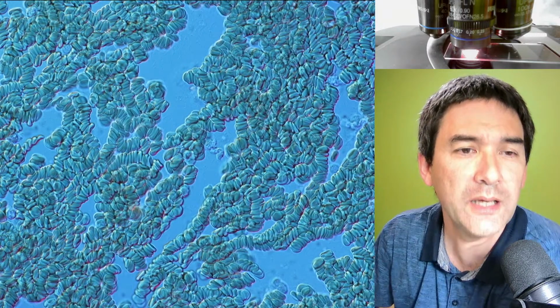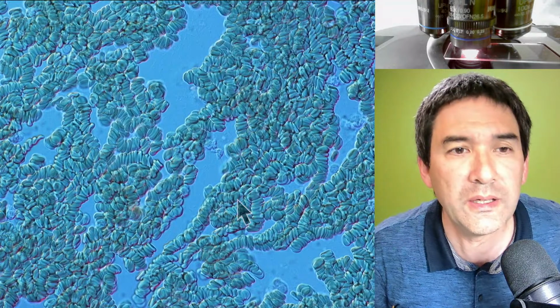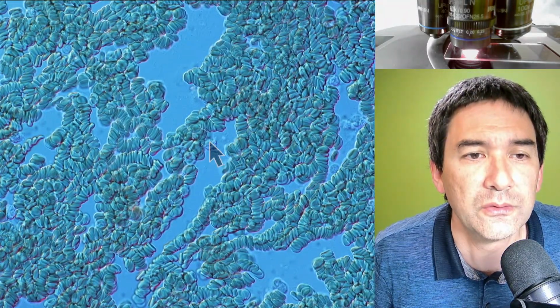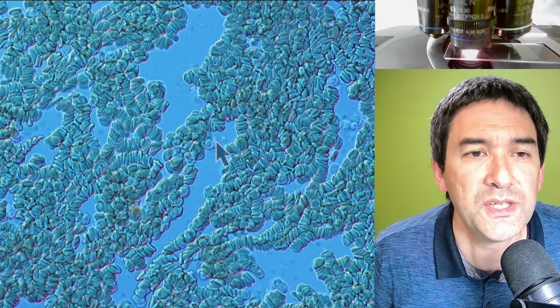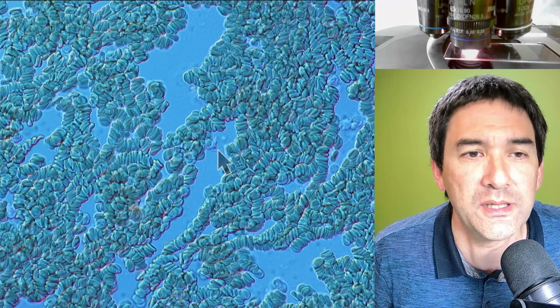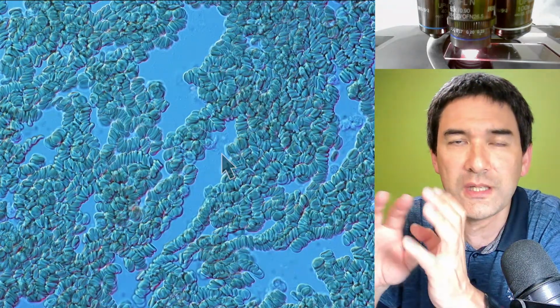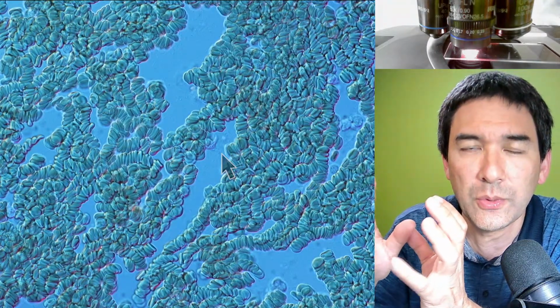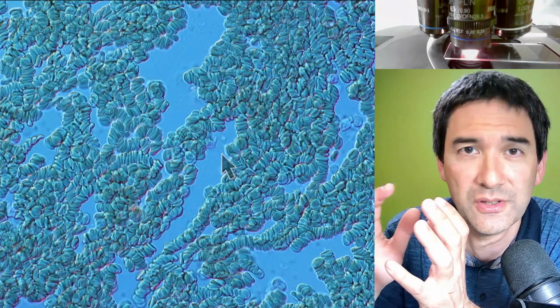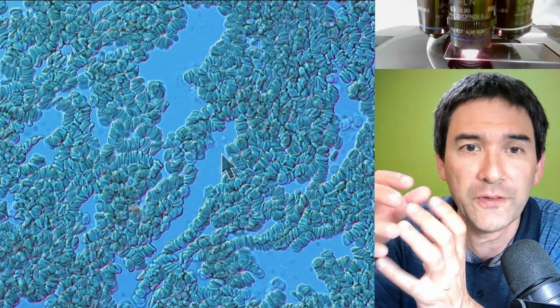So you might, I don't know, look, this could be one. I'm going to turn on the arrow again. I don't know if you're able to see this. But for example, have a look at this one over here, right? If you see that it slowly changes its shape, this might be a white blood cell. There are so-called phagocytes in the blood, and what they do is they move around like an amoeba, and they remove dead cells and particles and, in the tissue, also bacteria and so on, by engulfing them.